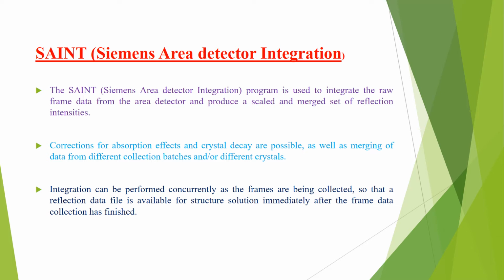The corrections for absorption effects and crystal decay are possible, as well as the merging of data from different collection batches or different crystals, using this SAINT software.